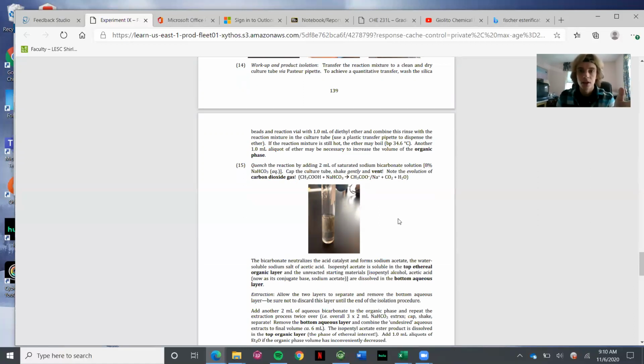And in this case, one of those times that you add water, the water wash is just to pull out the acid and the salt. Now that you've formed your ester, you can add water to extract byproducts and impurities. So in this case, you're also adding sodium bicarbonate to that water. So it's a sodium bicarbonate solution, not just water. And that's to neutralize any of the leftover acetic acid that's still in your solution that wasn't reacted.